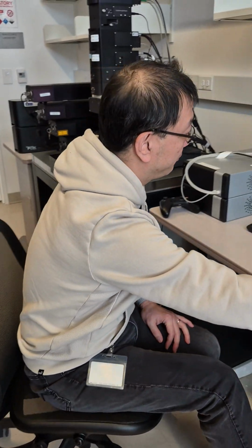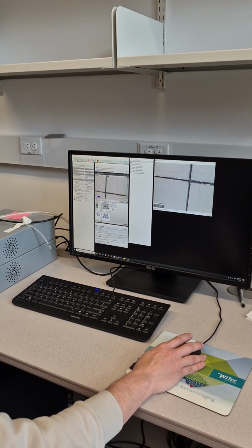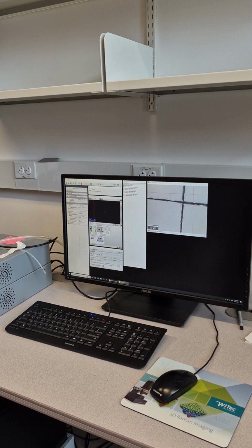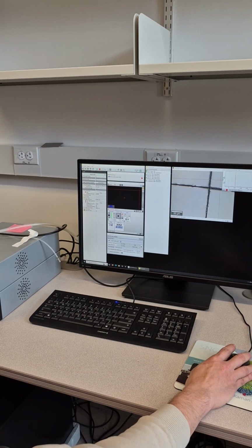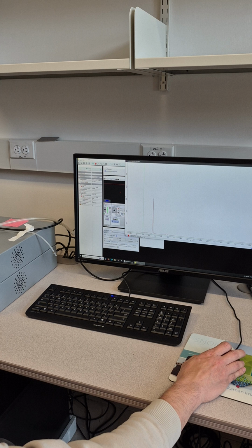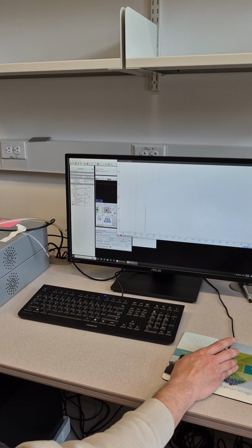You go to a different area, and you go to a new place. I always suggest you start the oscilloscope and do a quick check whether the signal is the best or not. So move to the half, bring down, bring up. Yeah, it's still the maximum.